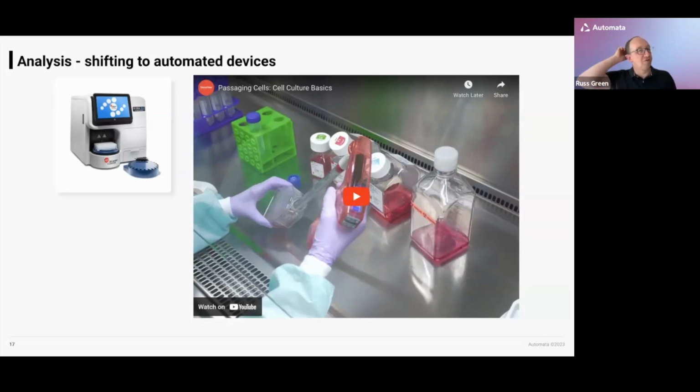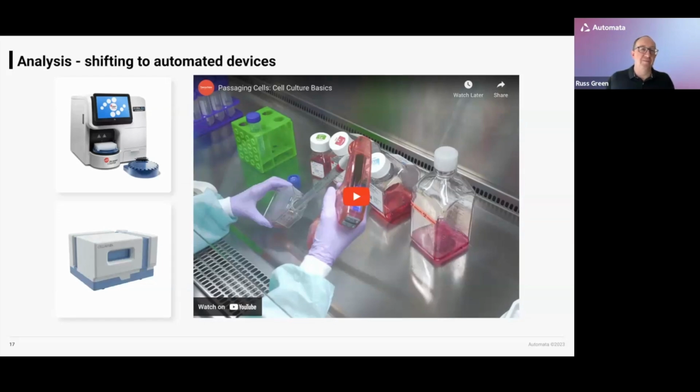I showed a manual microscope earlier on, which might be used for other measurements, such as looking at our confluency. But there are plenty of different kinds of automated imaging devices out there right now, depending on your needs. The one I'm showing here is the Synentec CellaVista. I tend to think of that as a relatively low magnification plate-based imager, where we can look at wells, look at confluency and start making decisions based on that data.